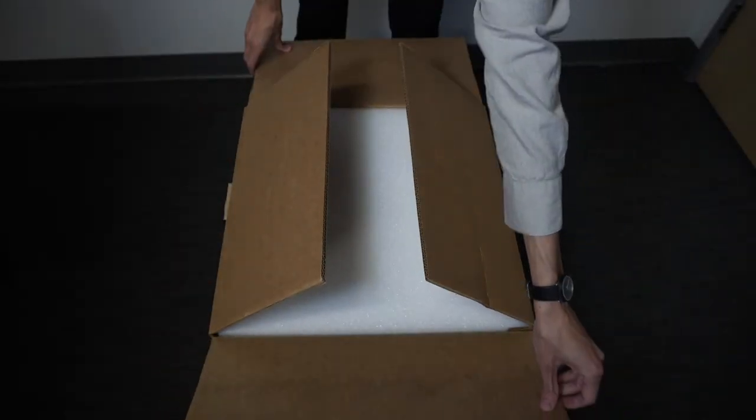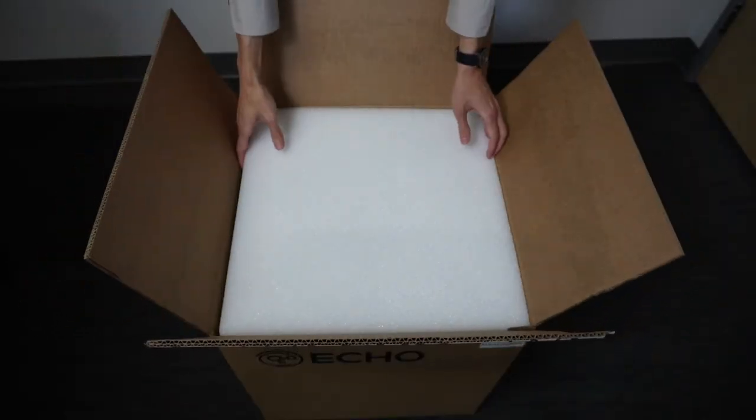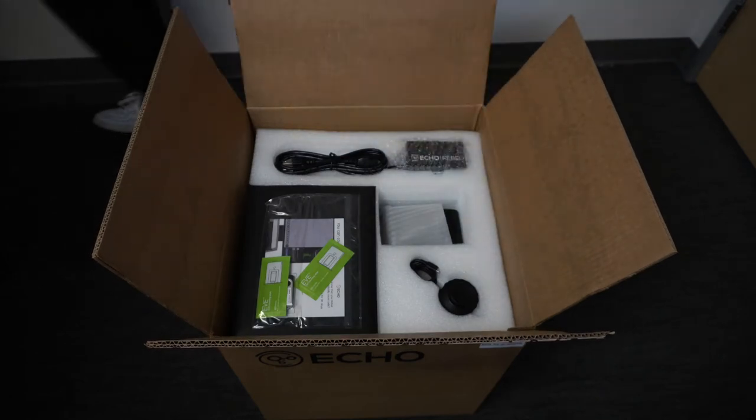You will have received your Rebel in a box. If you have ordered any additional accessories, you will have a second box. Let's unpack them.